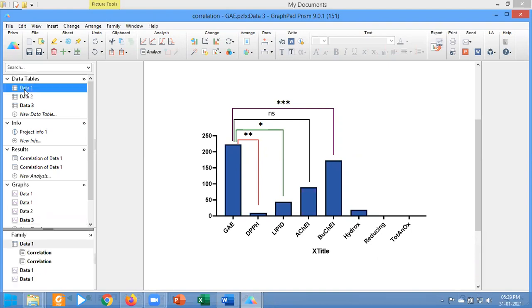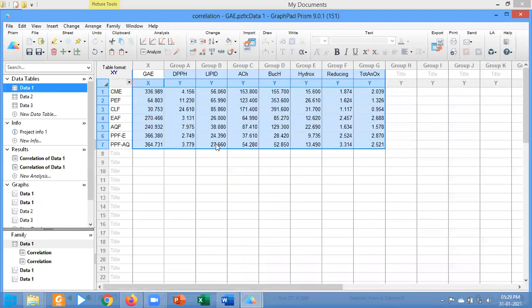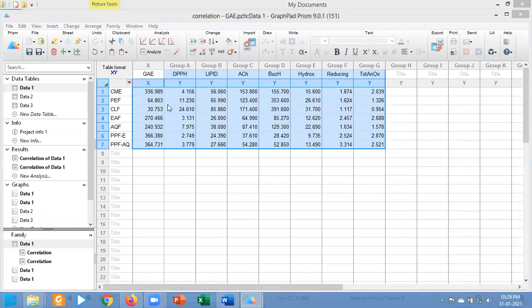First of all, you have to arrange the data. This is my data table. Here all the parameters are arranged in the column order. Now I am going to copy this and paste this in the row order.